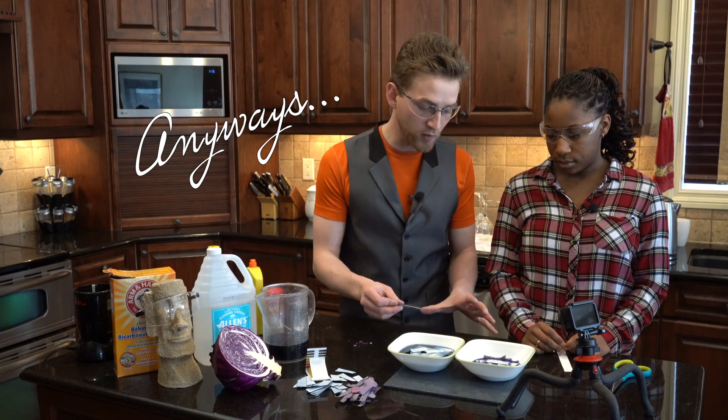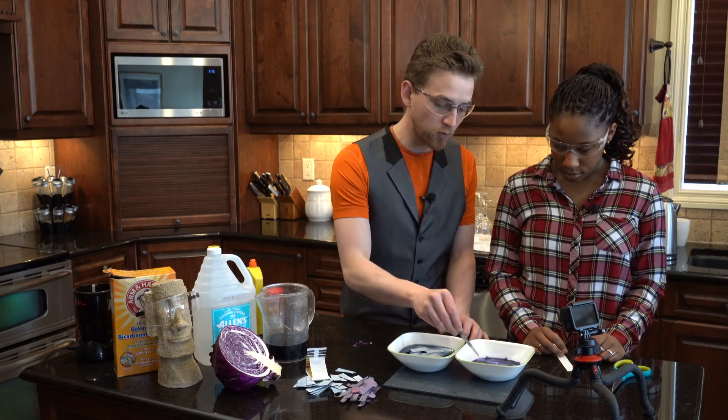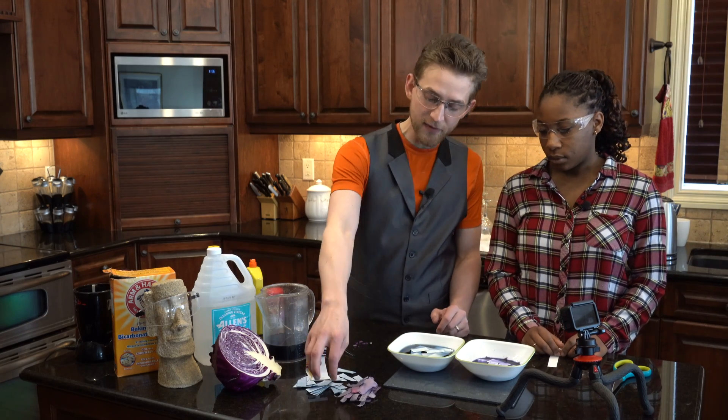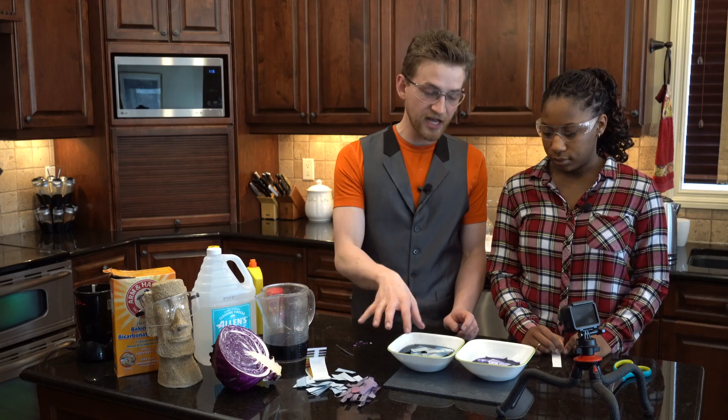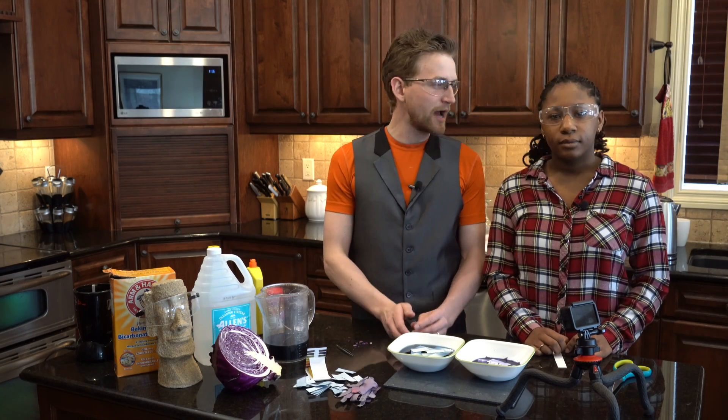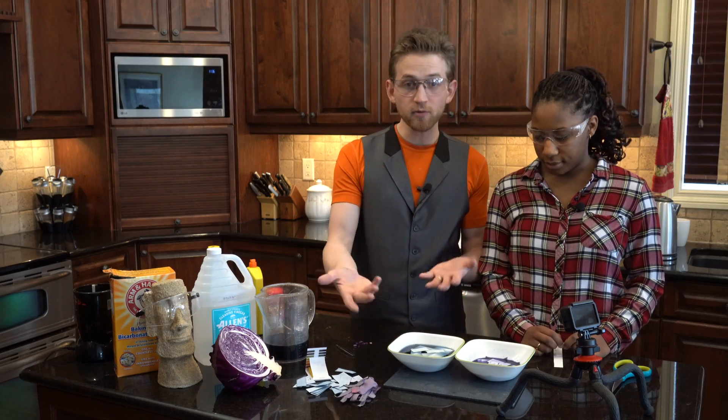So we're going to let these soak for a couple of hours, and while we wait for that, we're just going to continue on with our testing, because I made up a batch of these yesterday. In order to dry them out, just take them, place them onto a sheet of aluminum foil, and let them air dry. It takes about an hour for them to air dry. We'll just set these aside and we'll continue on.